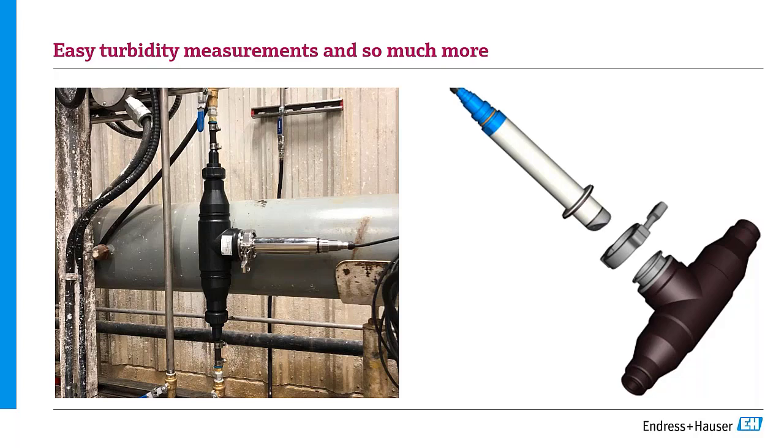But to reiterate the point, if your sensor's in a remote location that's not going to be visited very often, and you want to do preventative maintenance on it, then the ultrasonic cleaner is a really good way to make sure that we're not building up gunk on the sensor, that it's behaving accurately, and helps us feel confident in the measurement quality that we're getting.